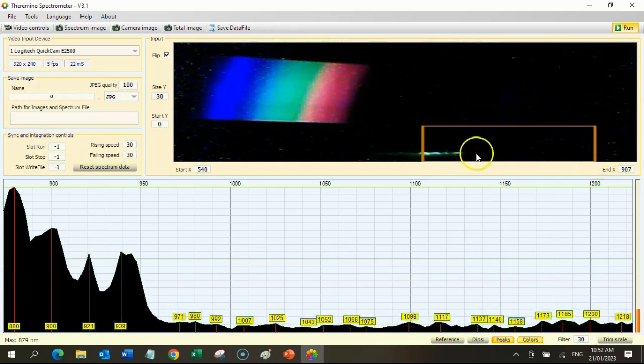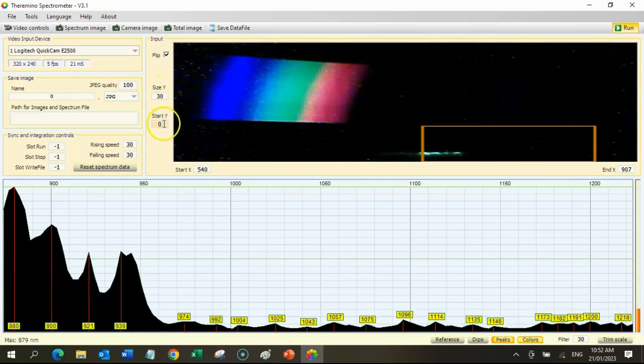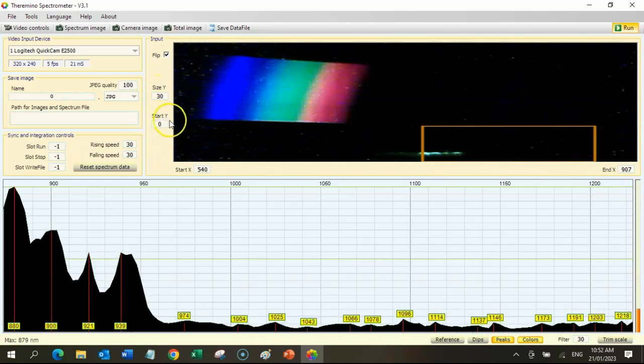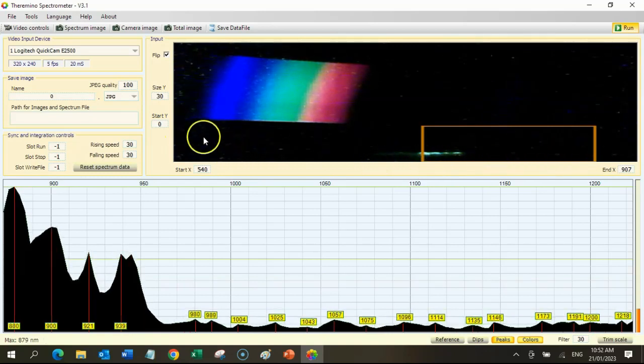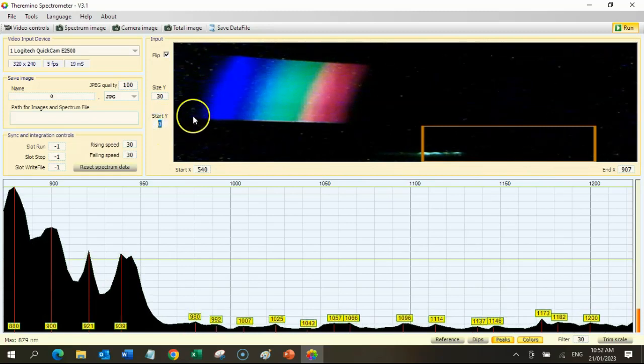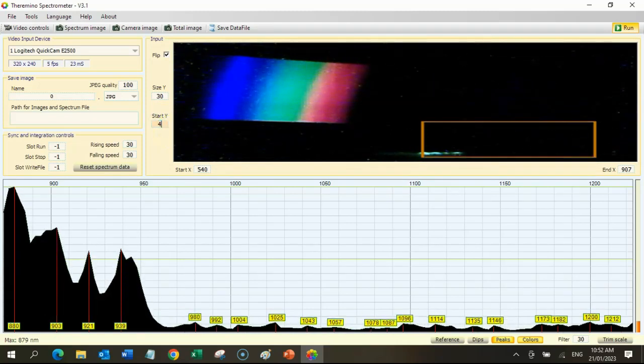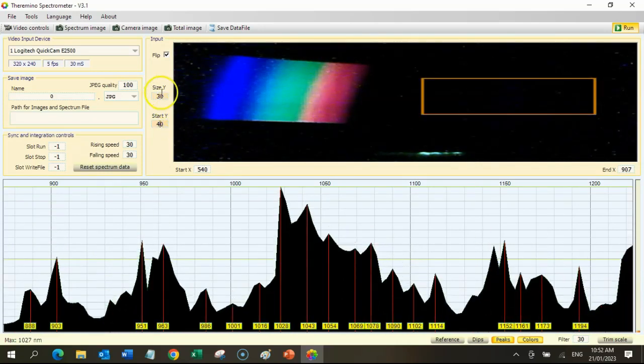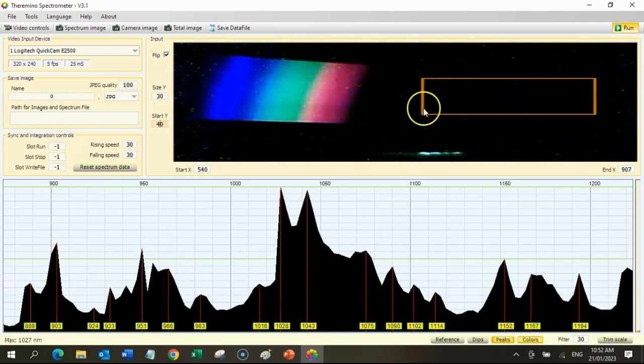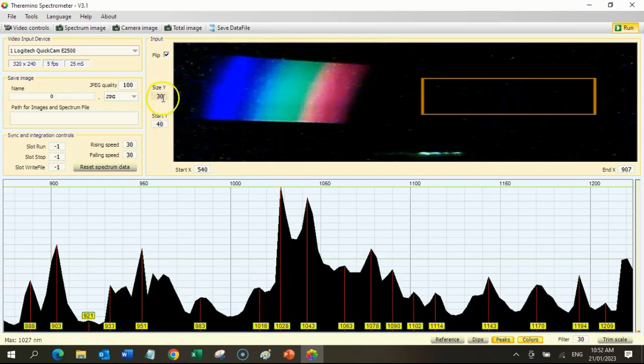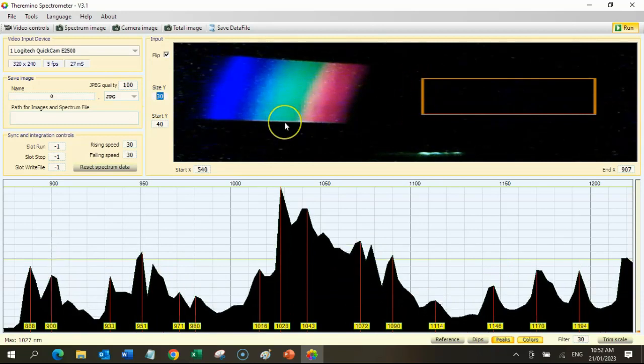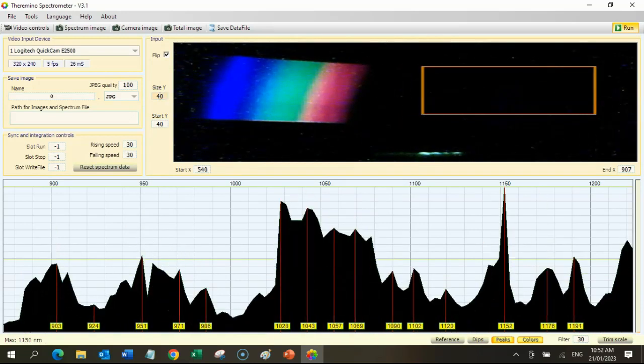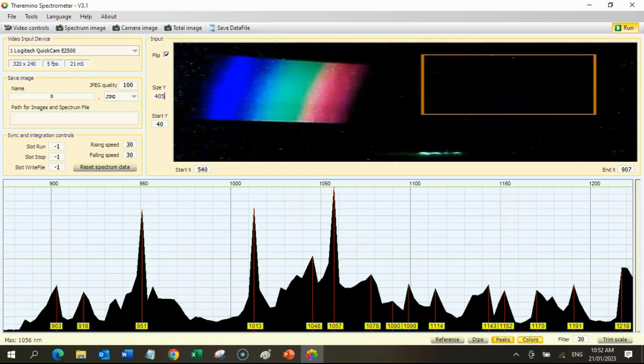The next step is to adjust the orange frame so that it sits around the spectrum on the top screen. The position of the bottom edge of the rectangle is managed by the Start Y setting. The Size Y number indicates how many pixels the top of the frame can be placed above the Start Y setting. In other words, it determines how high the frame is. So, now setting the bottom one to 40 and 50 pixels above that.